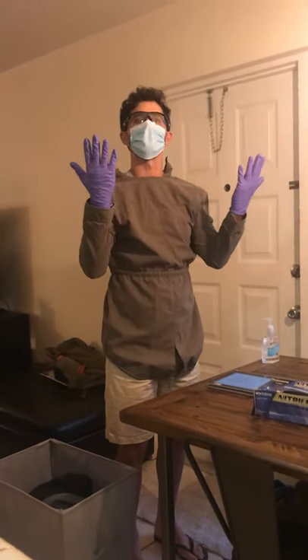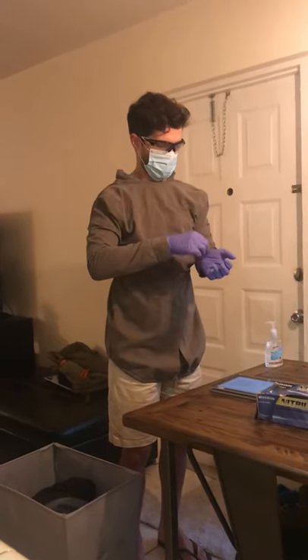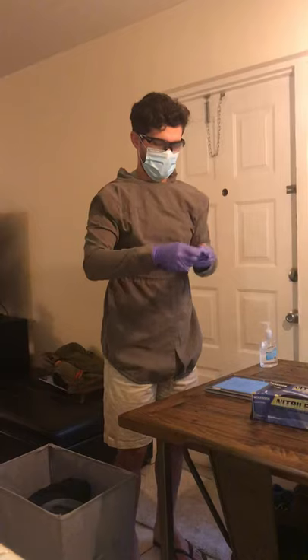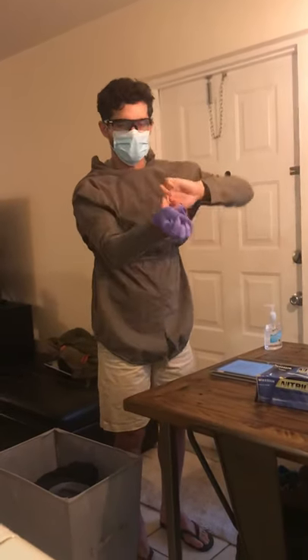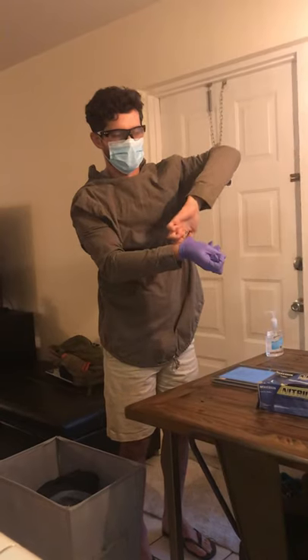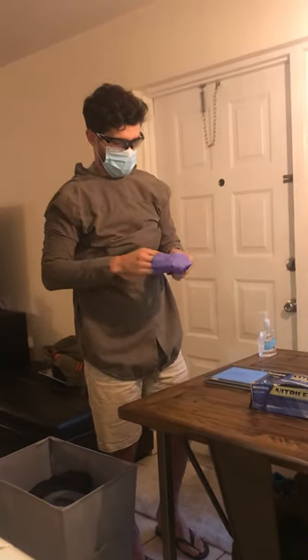We're all set. Now we're going to start with the gloves for the doffing. Take off one glove to the palm of the other. Now two fingers underneath. Remove the second glove. Dispose in the appropriate container.